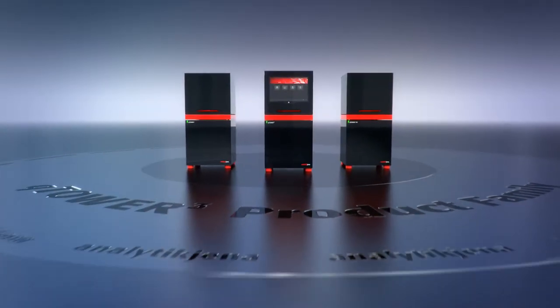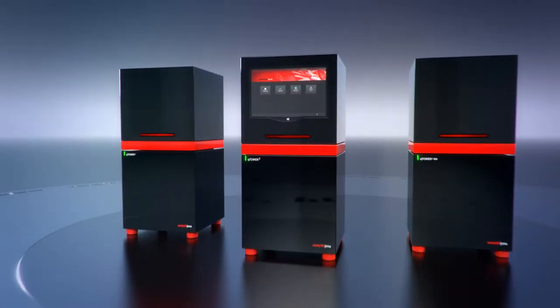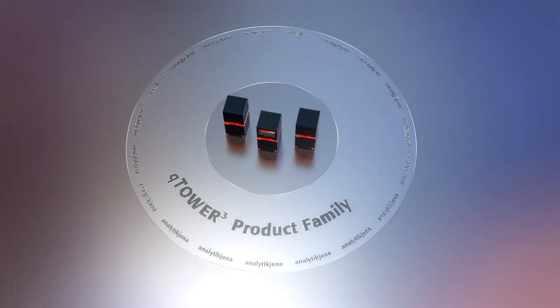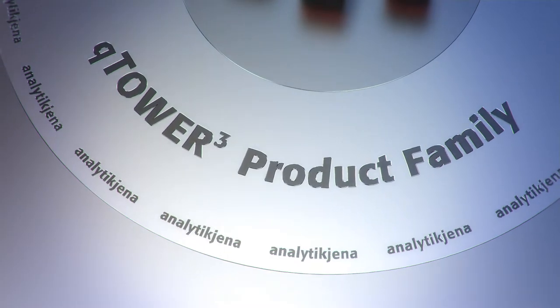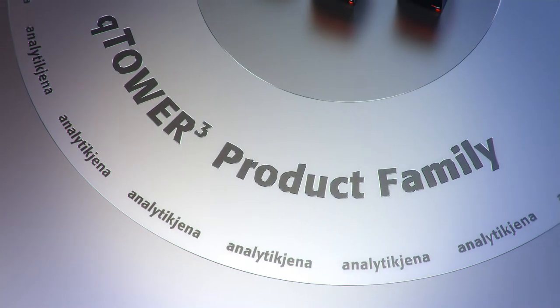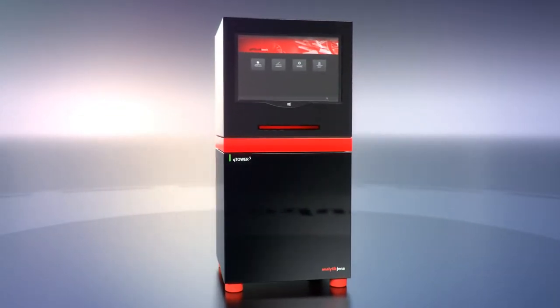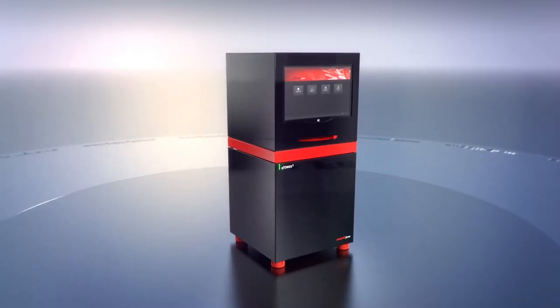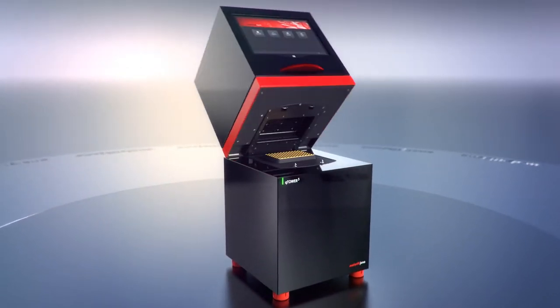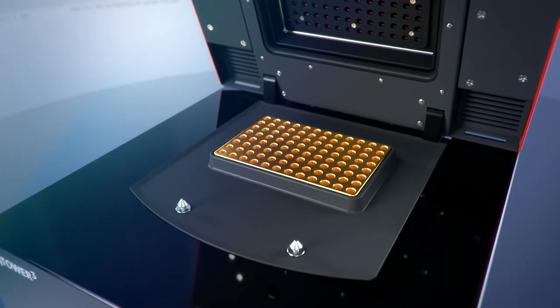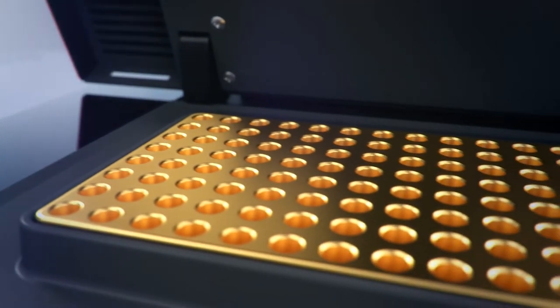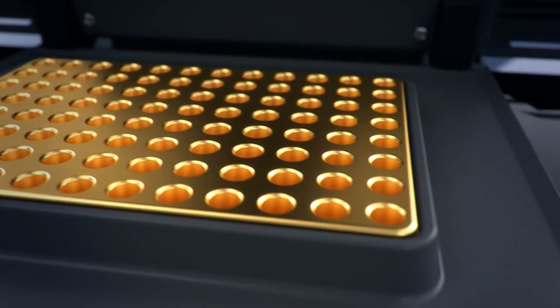Vision, amazement, simplicity. Q Tower 3 product family are powerful real-time PCR thermal cyclers integrating high-class technology with striking design. An ideal companion for day-to-day lab work, the high-grade silver sample block provides outstanding temperature accuracy across all 96 wells. Fast adjustable ramping rates of up to 8 degrees Celsius per second epitomize the performance of this modern thermal cycler.